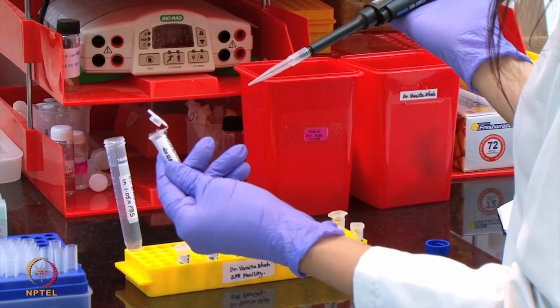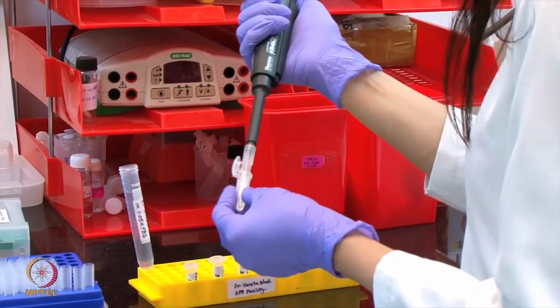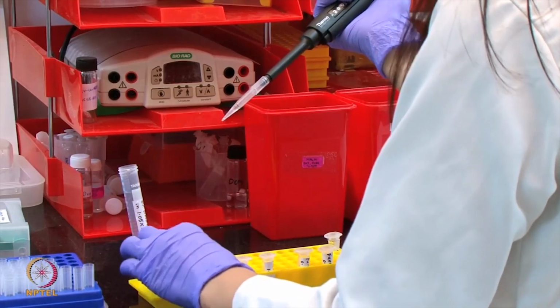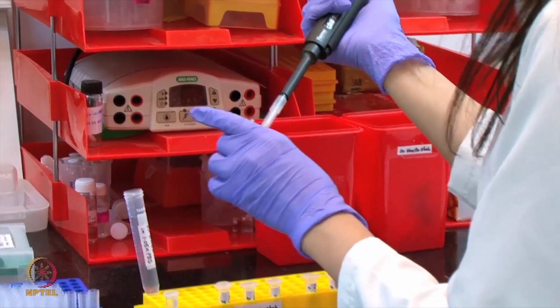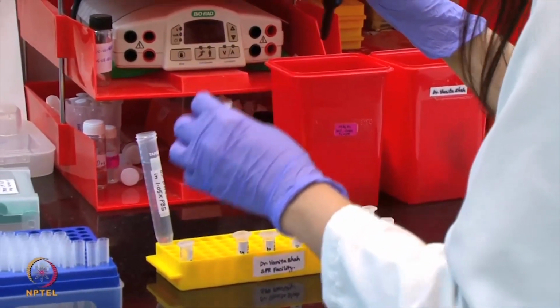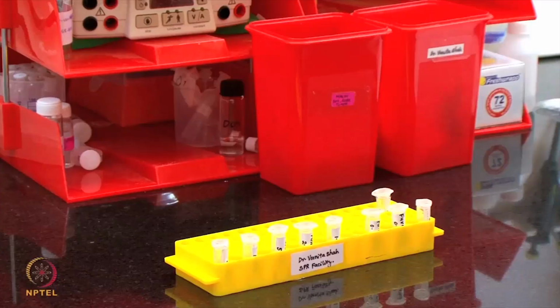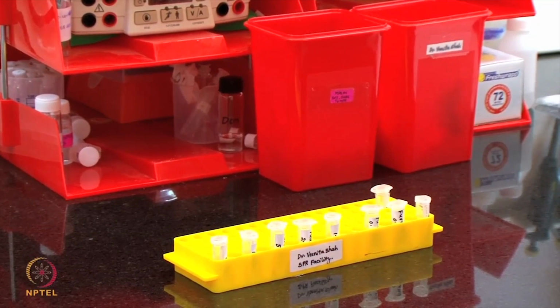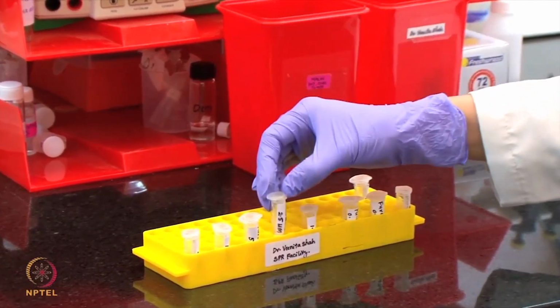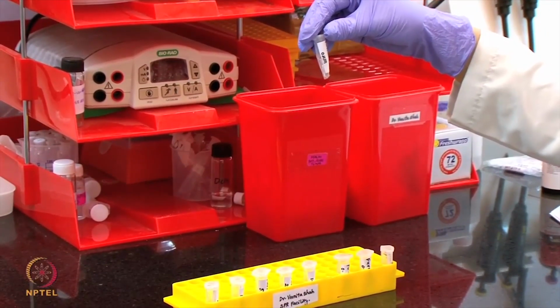We will prepare this concentration series in 2-fold dilution using running buffer starting from 20 micromolar, which means we will mix 200 microliter of 20 micromolar protein with 200 microliter of running buffer to get the 10 micromolar concentration. We similarly continue the 2-fold dilution to obtain the rest of the concentration series. One of the concentrations should be run in duplicate. So here in this experiment, we will be running 2.5 micromolar concentration in duplicate, and we will also include 3 zero concentrations, which will be nothing but the running buffer.